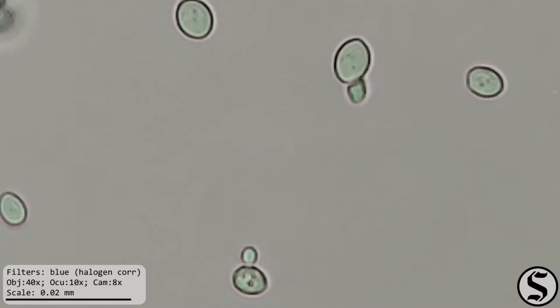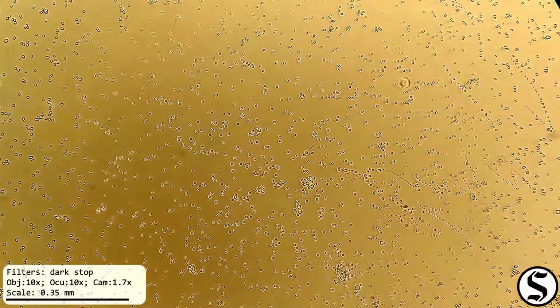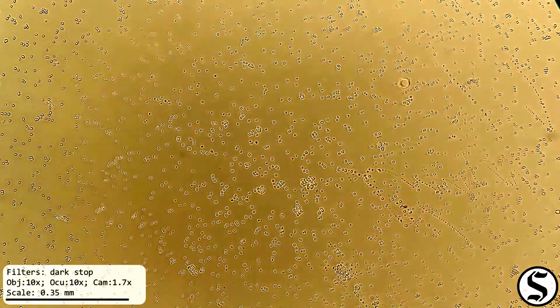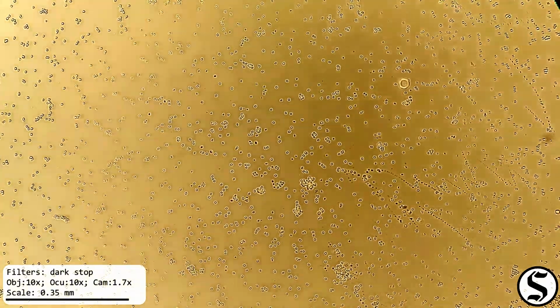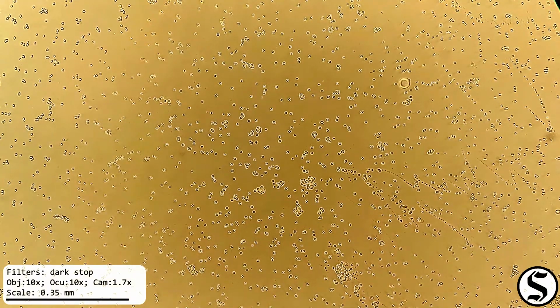I decided to experiment with this strange filter. I just made it out of a couple pieces of plastic and punched some holes in it, and I thought the results were interesting. It's, I guess, a kind of oblique illumination.